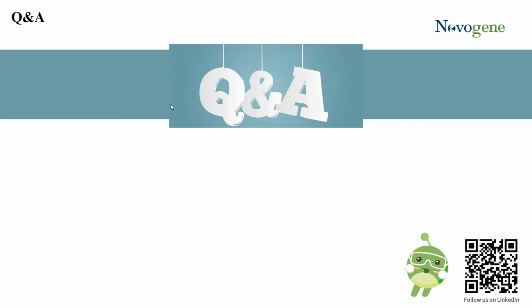There was another question actually from Felipe. Abhi, maybe you can speak to this as far as how many replicates do you recommend for a differential gene expression experiment? We recommend at least 3 to 4 biological replicates per condition for differential gene expression. If you have more, which is good, but because it's per sample price for mRNA-seq, definitely the minimum is 3 to 4 biological replicates.